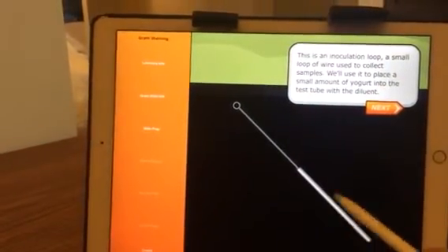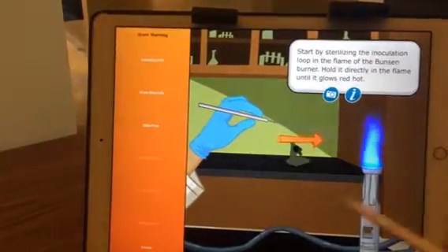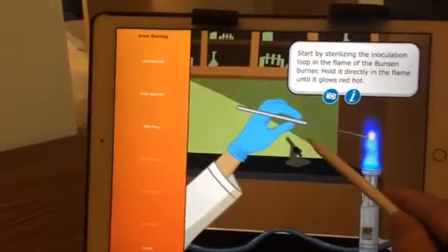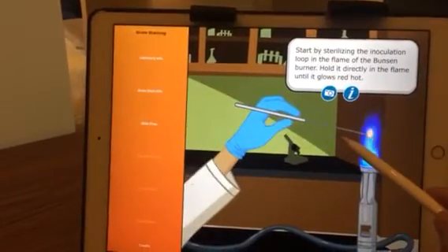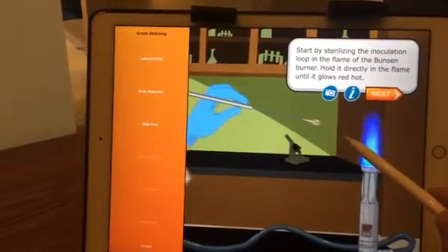This is an inoculation loop. Start by sterilizing the inoculation loop in the flame of the Bunsen burner. Hold it directly in the flame until it glows red hot.